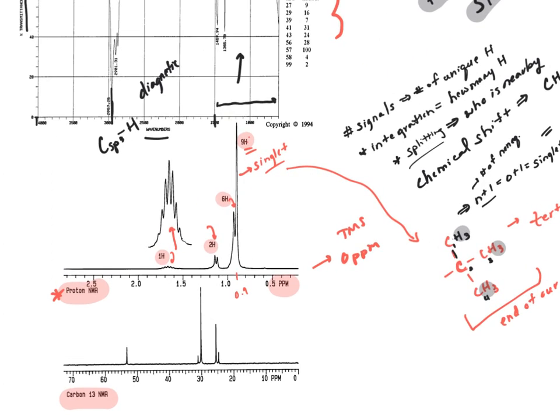Okay, so then after that, another very canonical pattern in the proton NMR spectrum for a very specific type of structural feature was what we find here. So we have a signal here that is kind of being obscured by that 9 proton singlet, right?